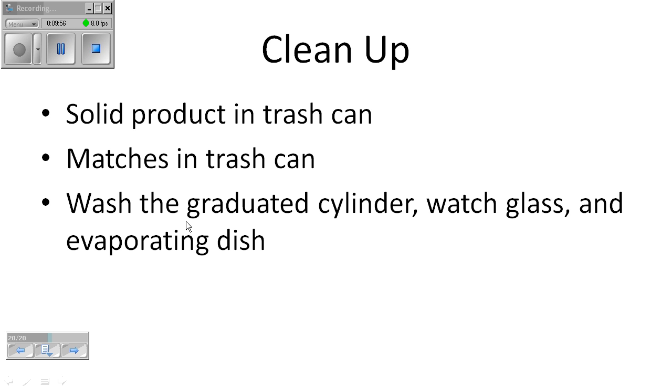Okay, so that wraps up the lab setup video. If you need to, you can watch this again. You can rewind it, whatever you need to make sure that you are ready to do this lab when it's scheduled.